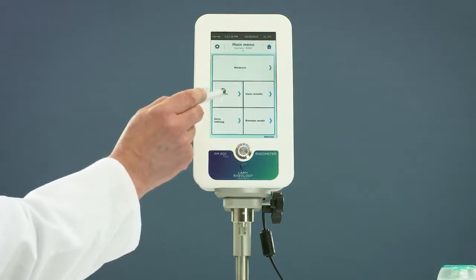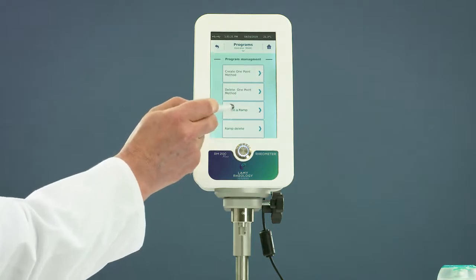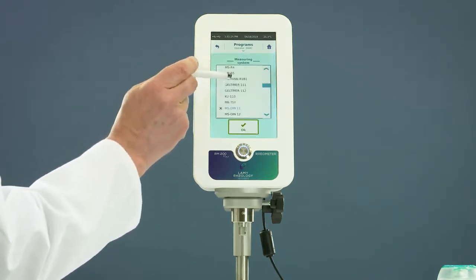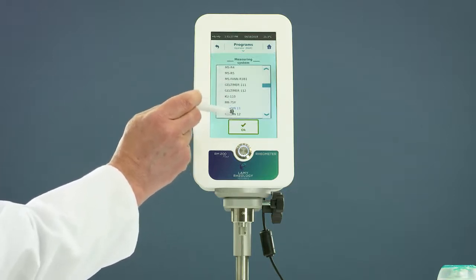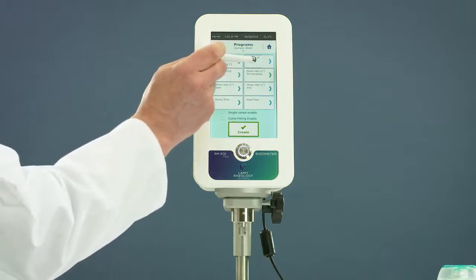Go to program menu to set a method. For the ramp, select the spindle and set the number of points.